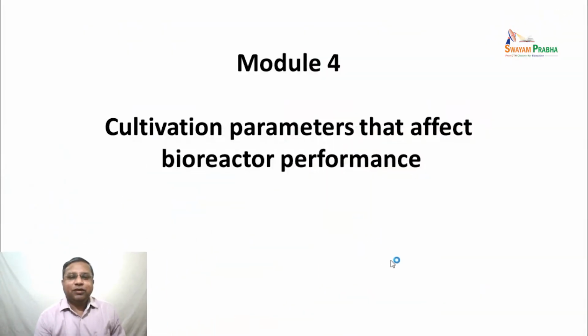Welcome to lecture 14 in the NPTEL online certification course on bioreactors. We will begin module 4 in this lecture. The title of module 4 is cultivation parameters that affect bioreactor performance.